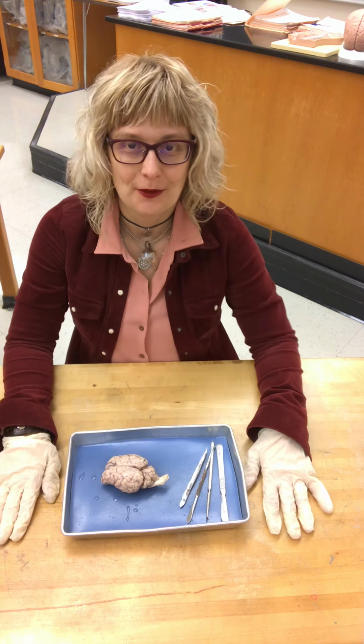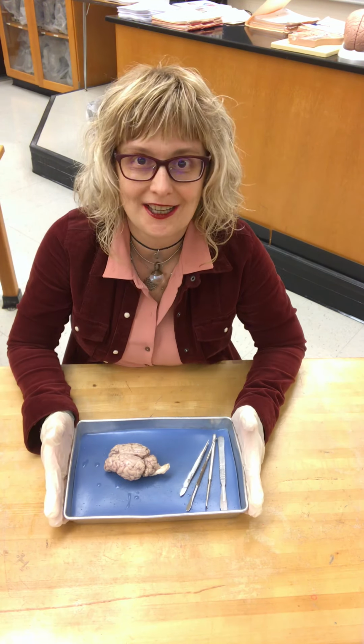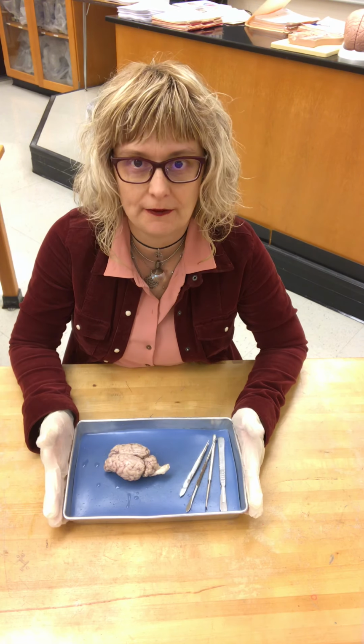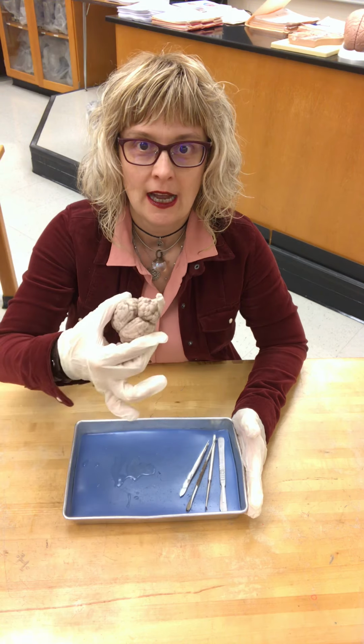I'm Dr. Milescu. I am adjunct professor at Daytona State College-Deland campus, and today's video is all about brain dissection. We're going to identify the major parts of the brain. This here is a sheep brain. I'm going to show you how to dissect it today for anatomy lab, and also identify structures that you will need to know for your practical.